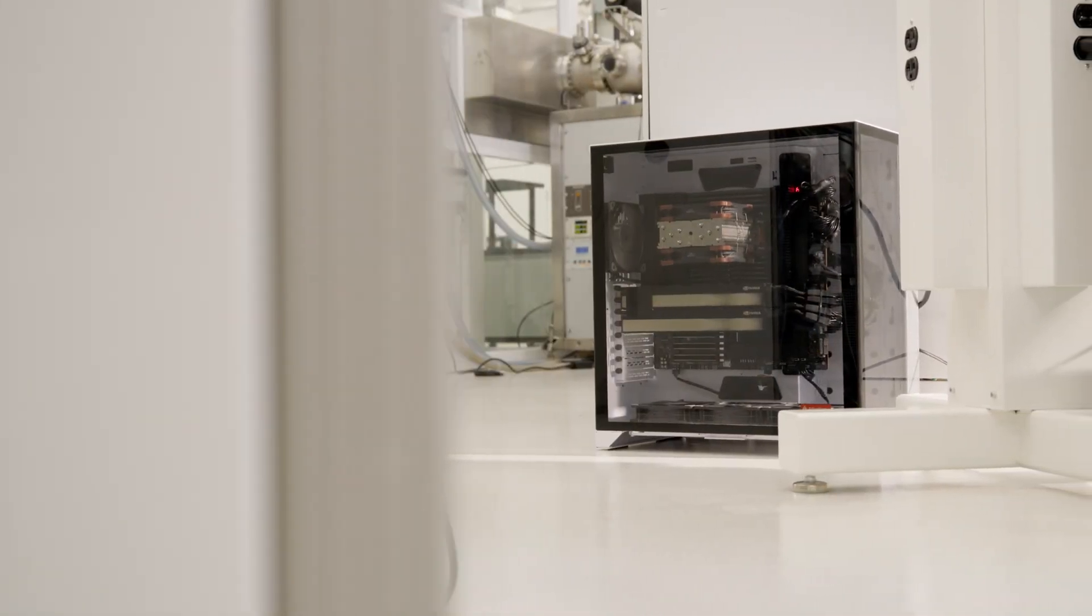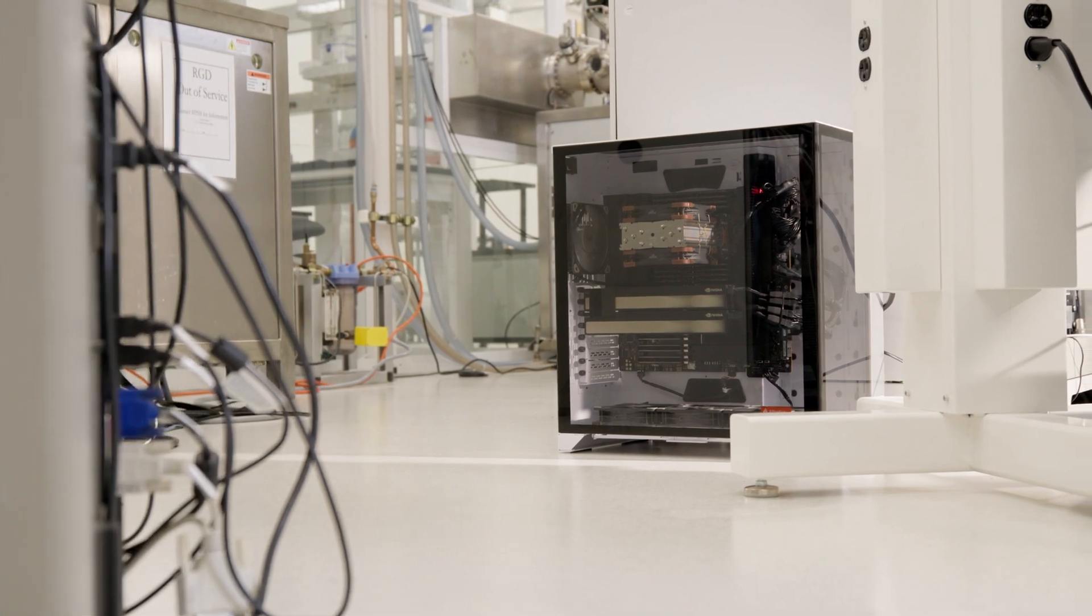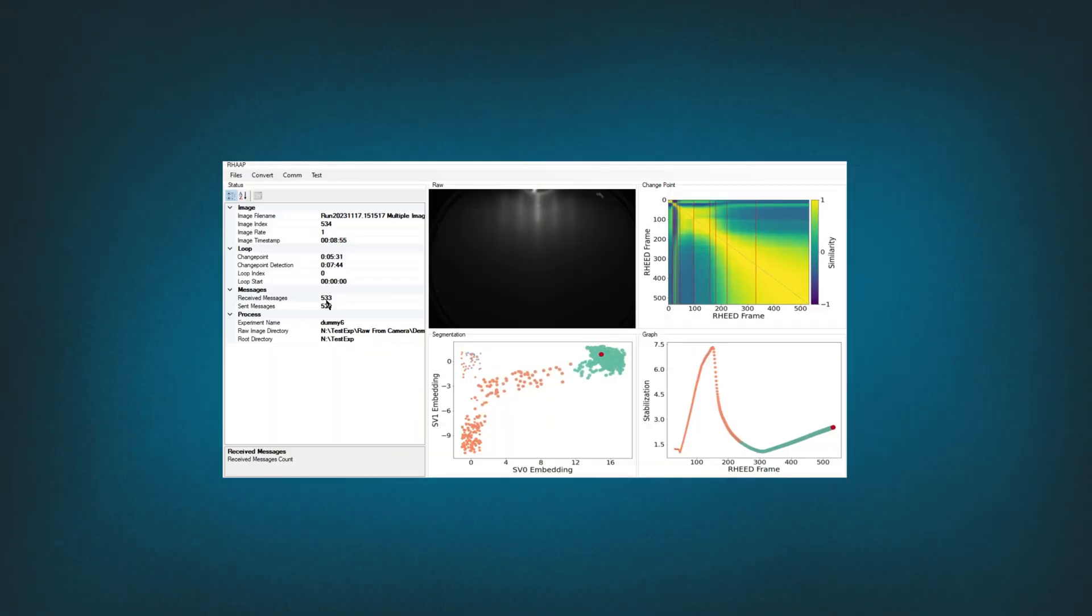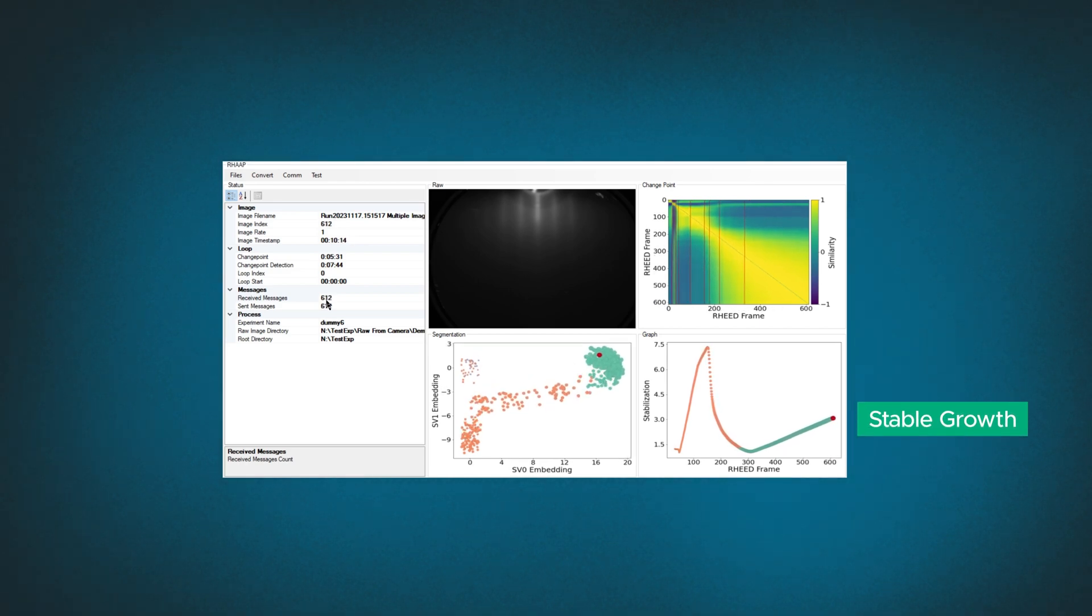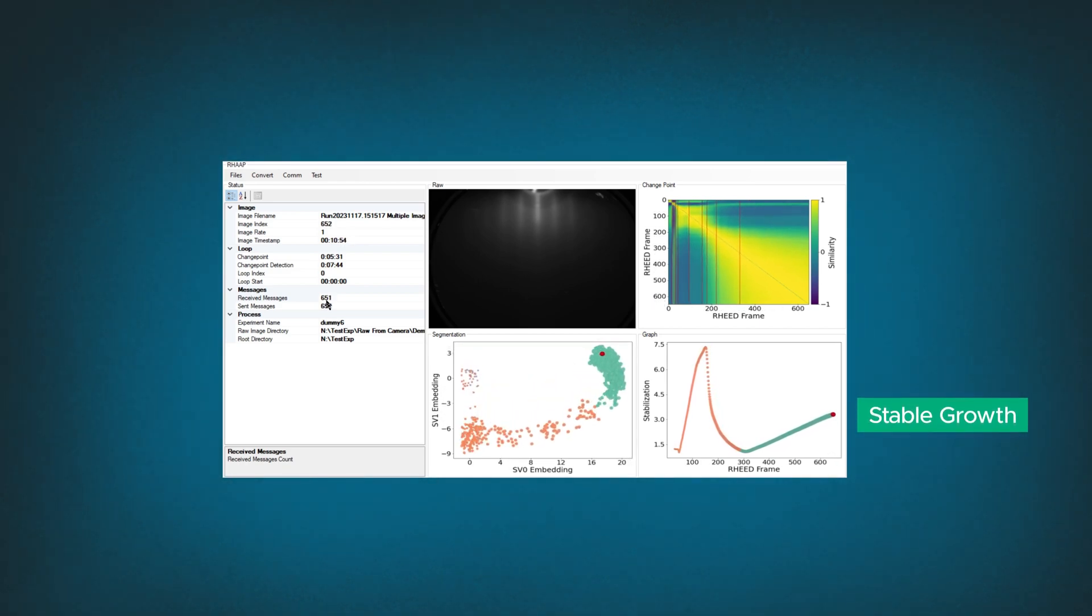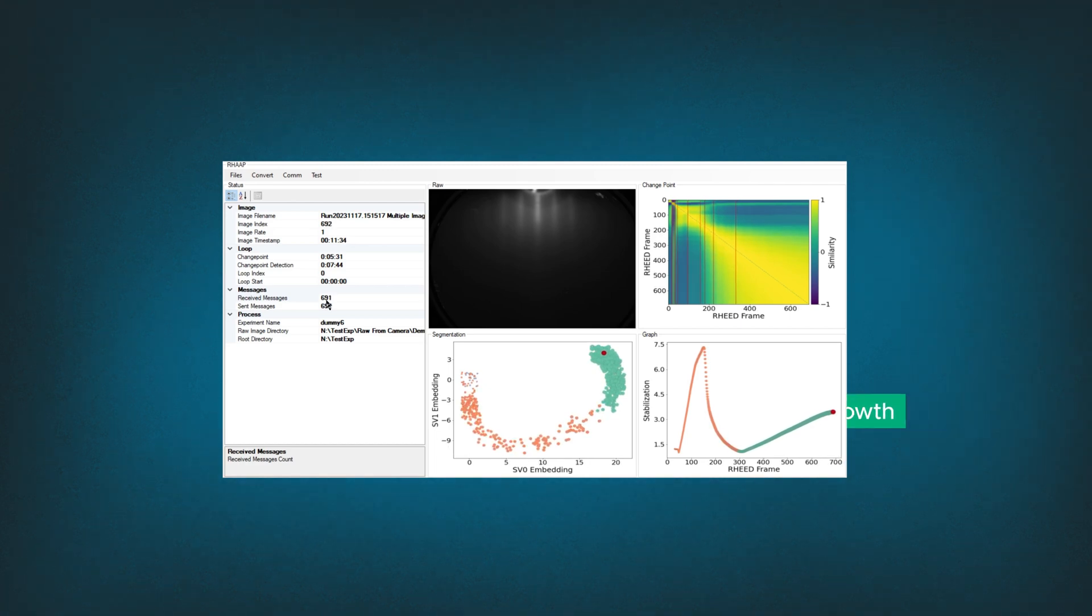When we look at this experiment again, something else is watching too. It's a machine learning algorithm. The research team has programmed the algorithm to analyze these images in real-time and detect changes early.